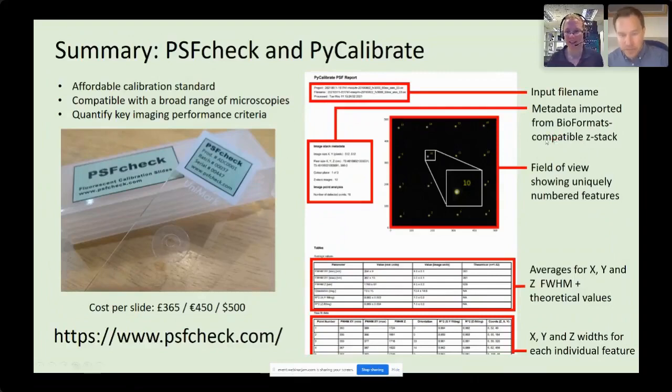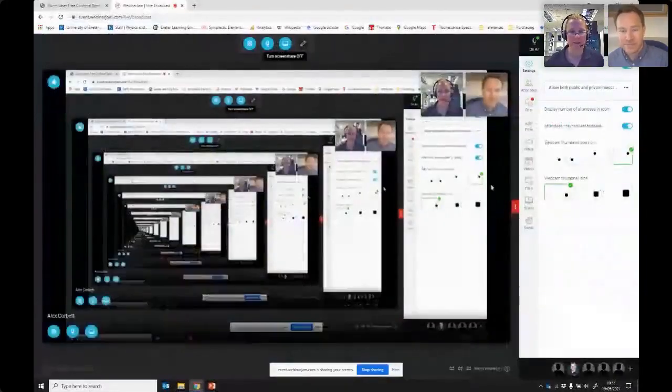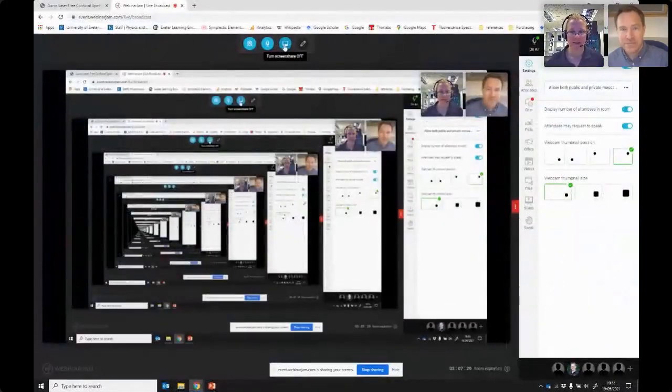Thank you very much, Alex. We have one of those slides in our lab as well, and it's been very, very useful for benchmarking our confocal microscopes. So we're rapidly running out of time for this session.